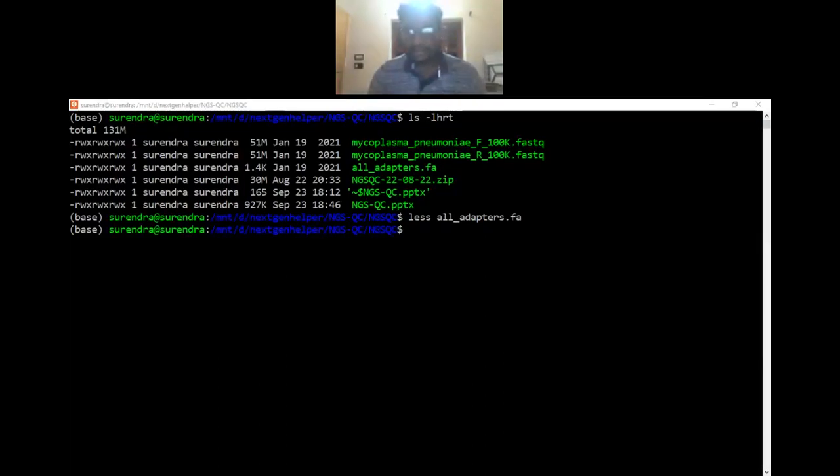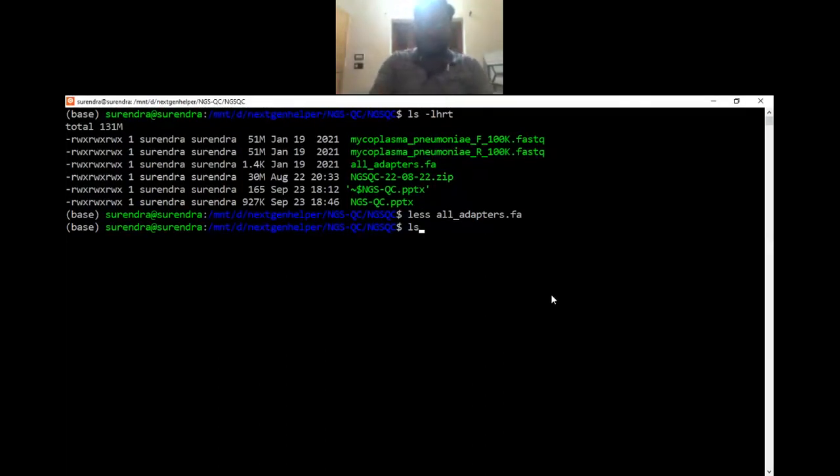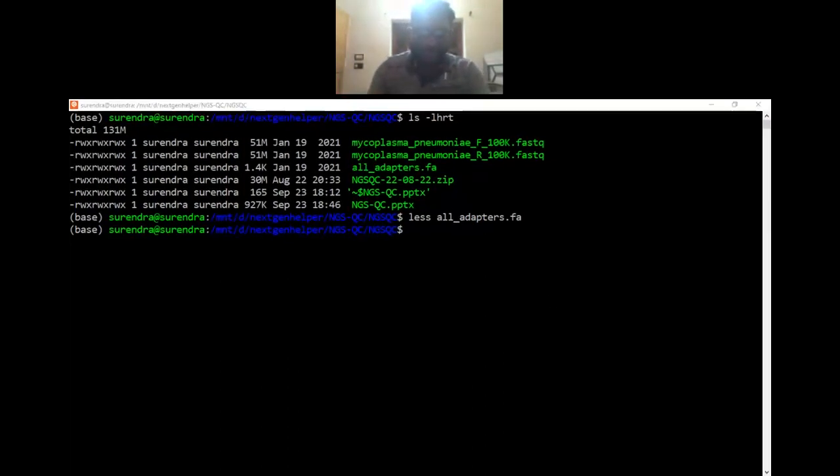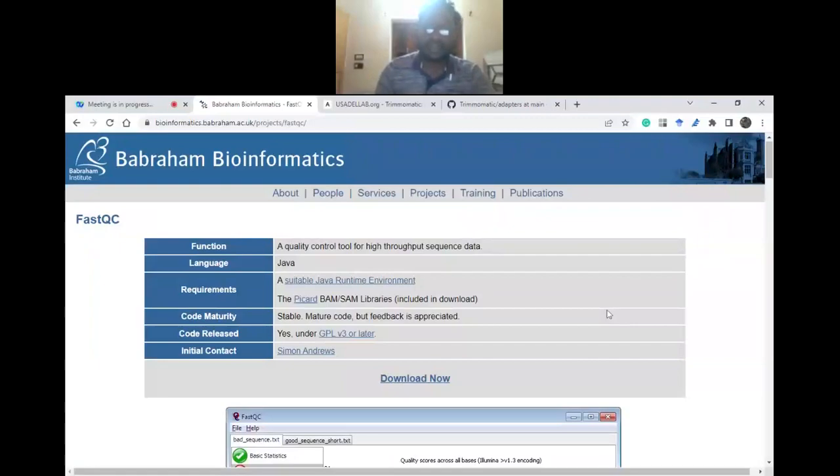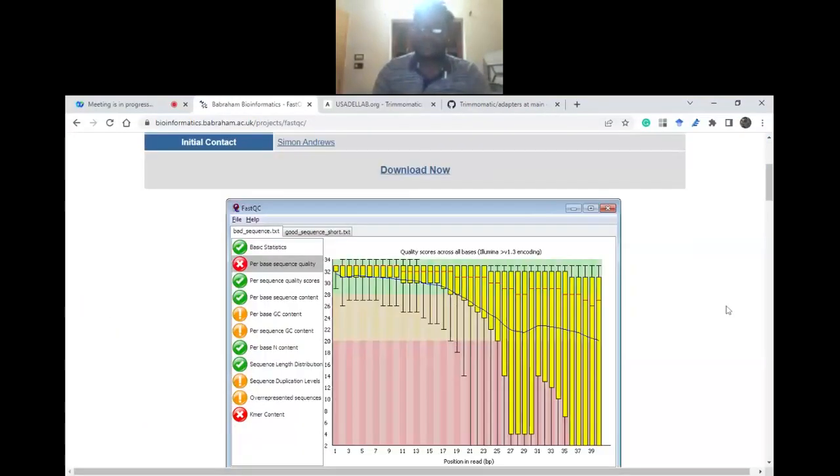Okay, so let me share the screen. I think it is shared. Let me first show you the website here. This is the FastQC website. The link is there. You can download it and install it.